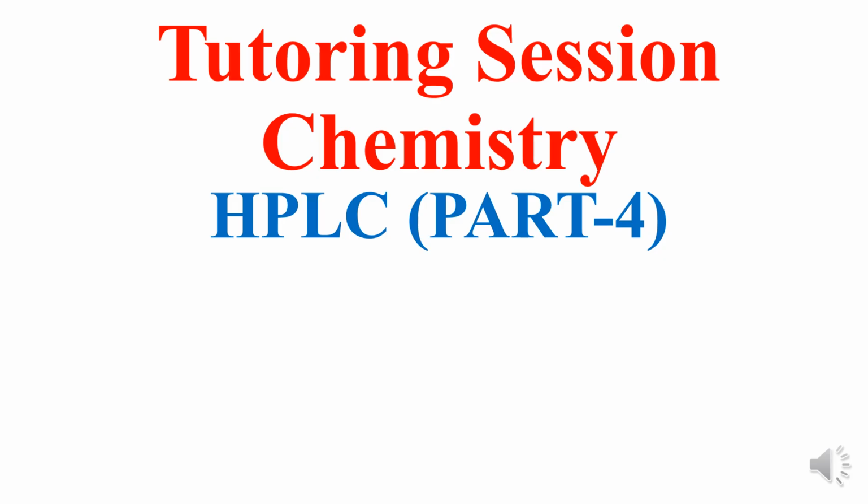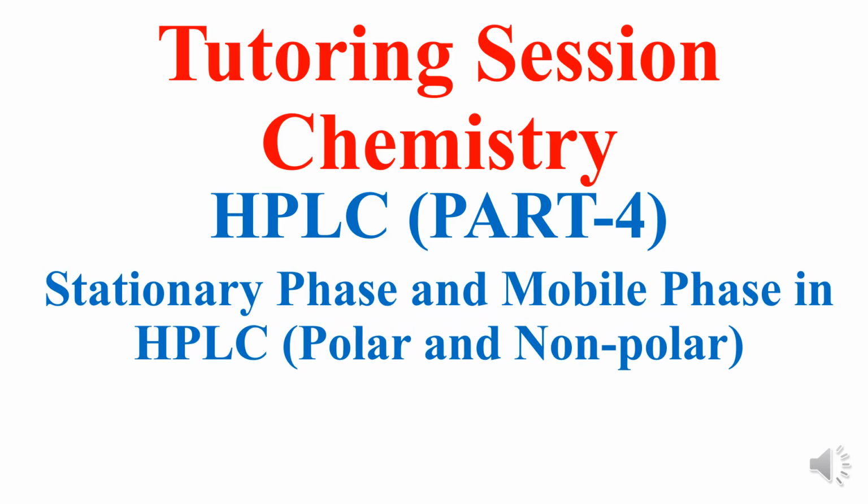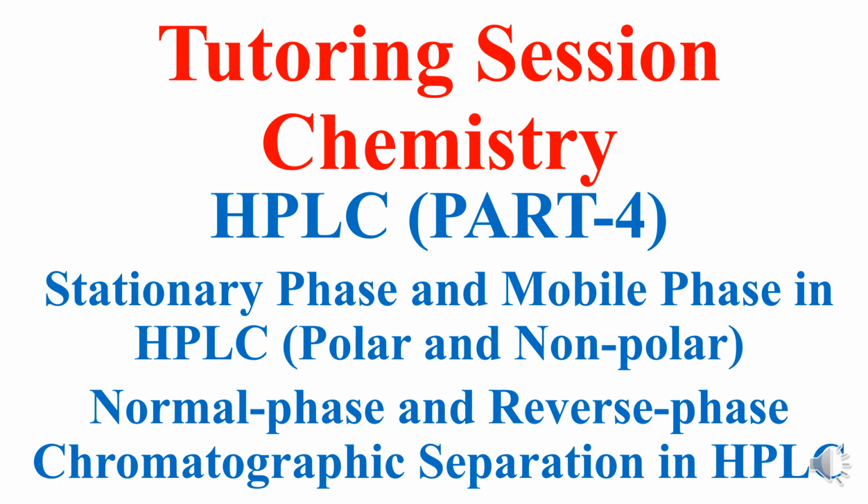I'll begin the video with a detailed explanation about the general features of instrumentation in HPLC setup. This will be followed by stationary phase and mobile phase used in HPLC that are of polar and non-polar nature. And later in the video, I'll explain the normal phase and reverse phase chromatographic separation in HPLC technique.